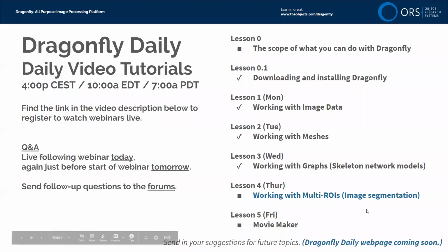Just as a reminder, this is lesson 4. Previous lessons are available online, streaming through YouTube. So this is the lesson on working with multi-ROIs. Tomorrow we'll hit a lesson on Movie Maker.